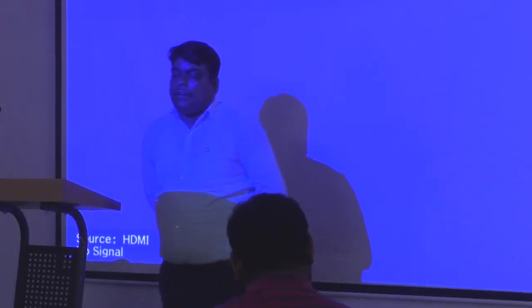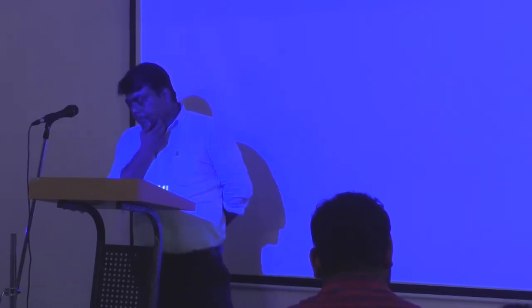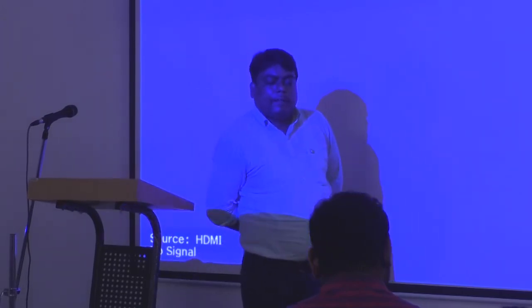Next step, क्या होगा? Remove the electrode and dip it in the water. To start the experiment again. And the last one is, switch off the instrument as given in the manual.